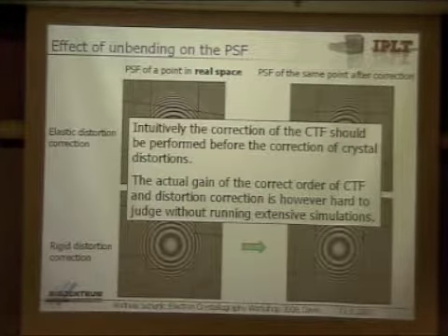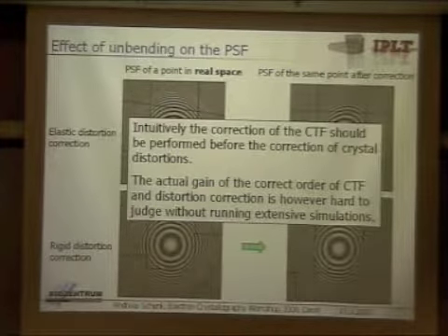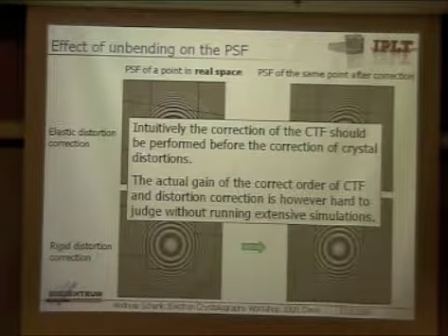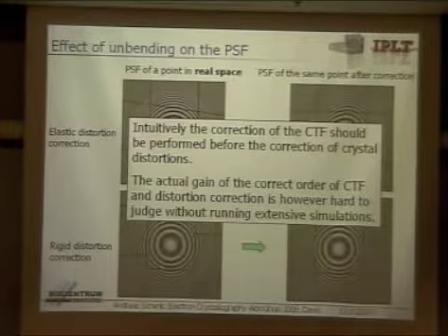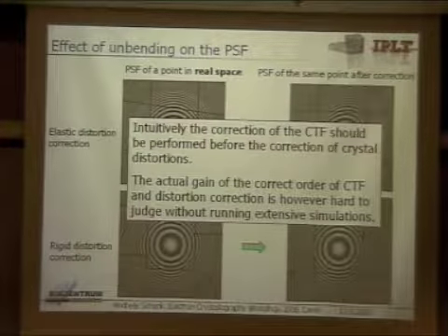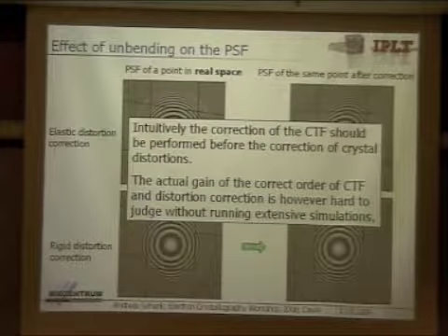And that's quite hard to answer if you don't have a proper simulation or if you work on experimental data. Because there you always have an uncertainty in your phases. And that's why we decided to do the whole thing on a simulation. Because if you simulate your crystal, you know exactly what the amplitudes and phases of your unit cell should be. So you can then also determine an accurate phase error.